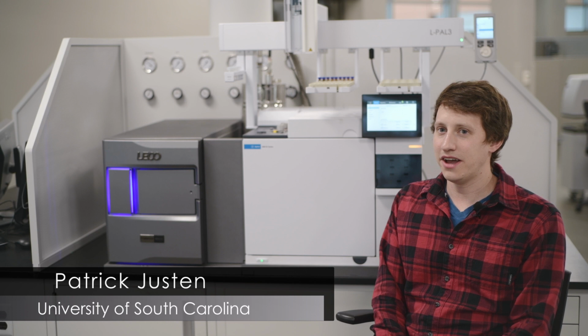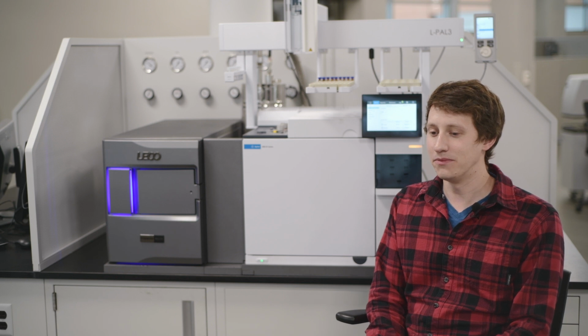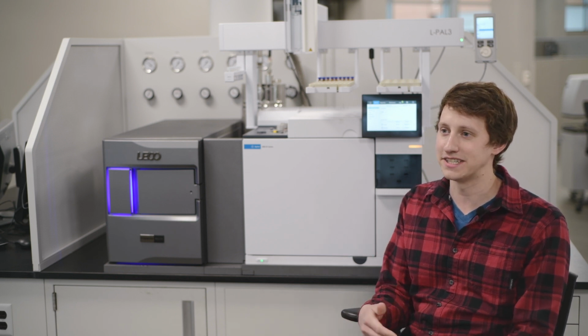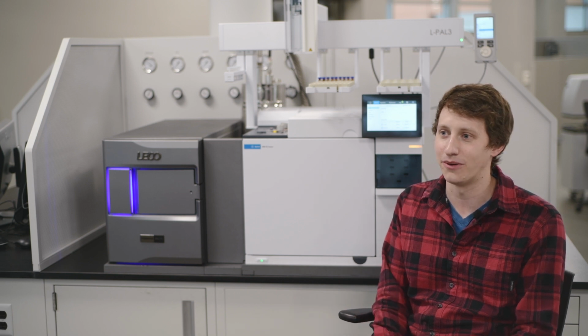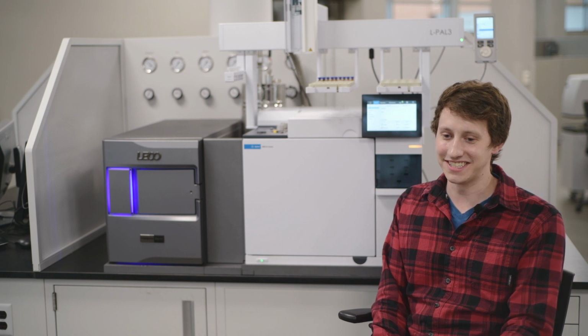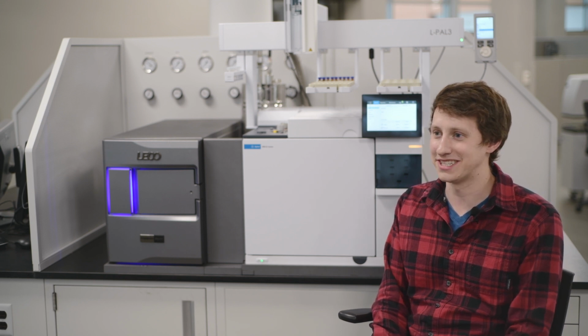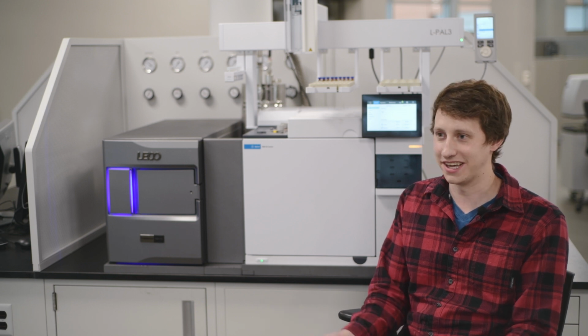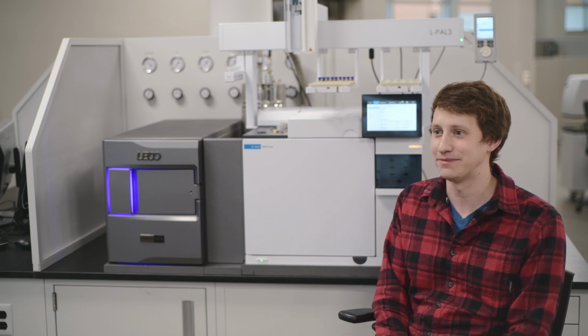Yeah, so we have our typical list of analytes that we look at that we find in a lot of different samples. We use different instruments for that. For the BT, we want to look for non-target stuff that's possibly never been found before, and also things that are unique to these urban samples that would be different from what you would find in, say, a forest that burned, and you're looking at the ash samples there.